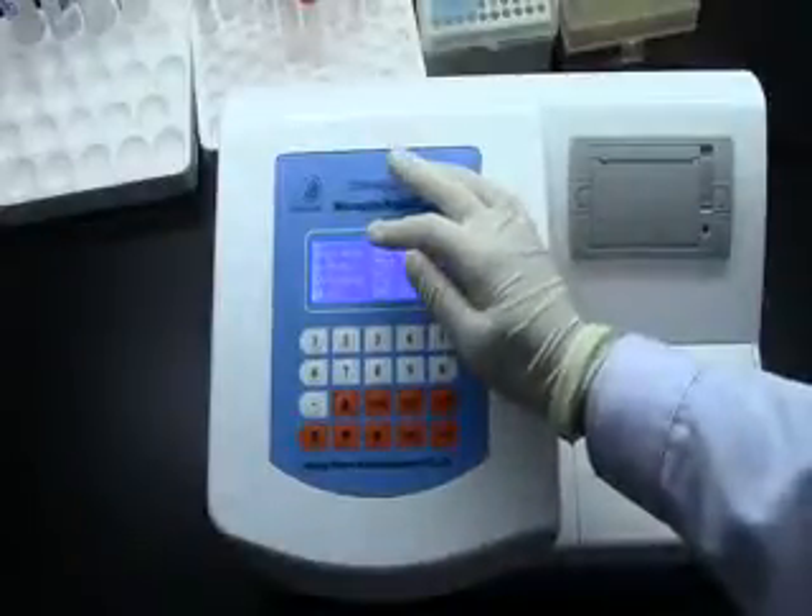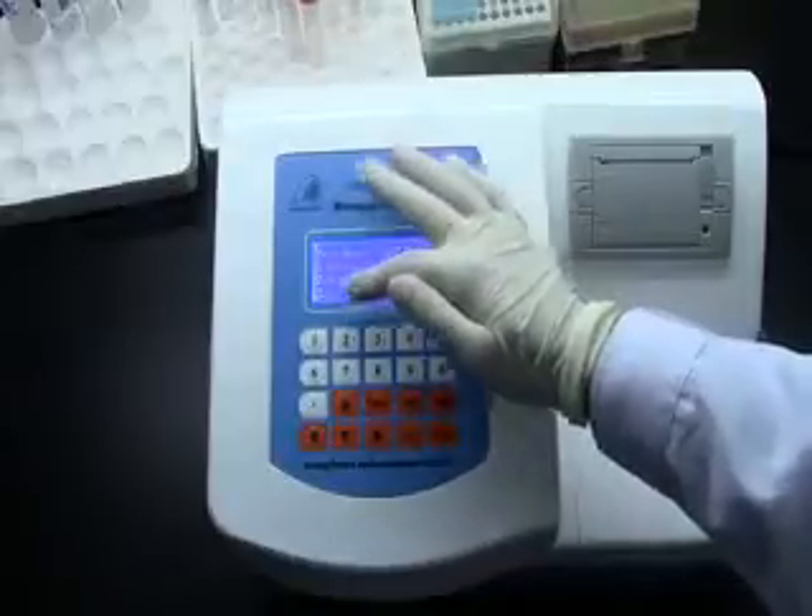It has three functions. One: detect. Two: program. Three: set.